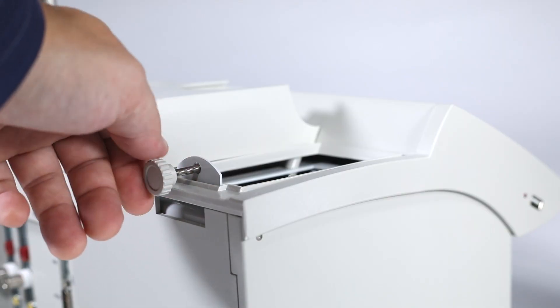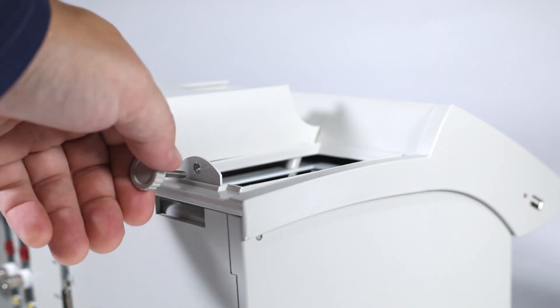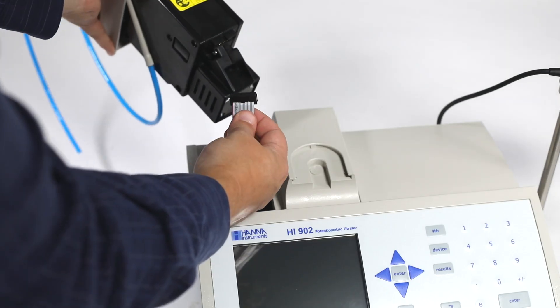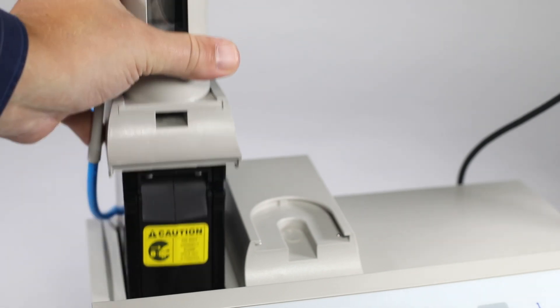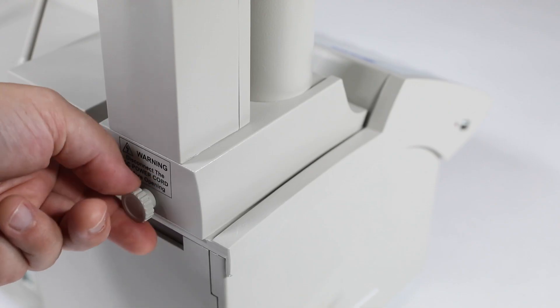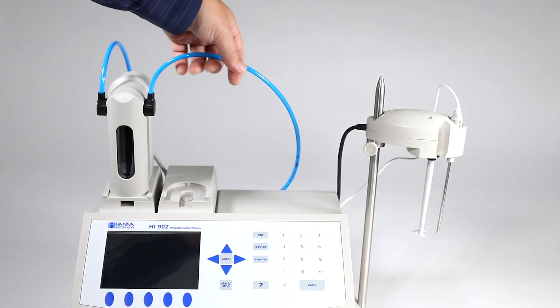Once assembled, the next step is the burette pump. Before installation, make sure the power cord is not plugged in. To install, remove the pump retaining screw and attach the inside cable to the pump. Place the pump into position and re-tighten the retaining screw. After that's done, take the titration tubing and dispensing tip and put them into place.